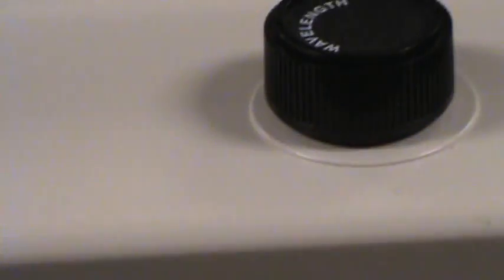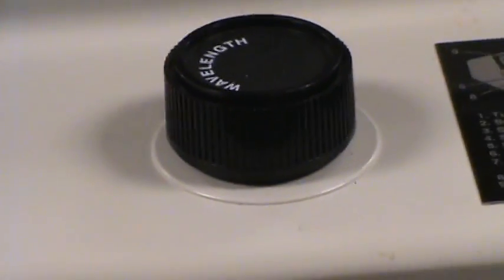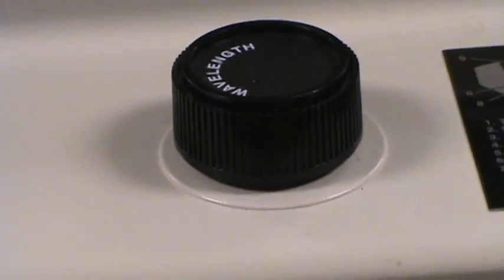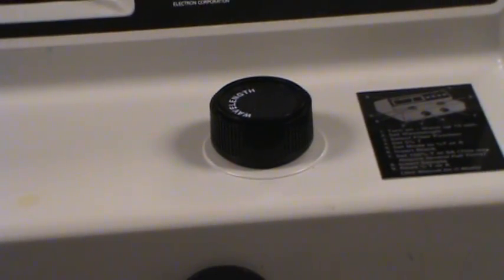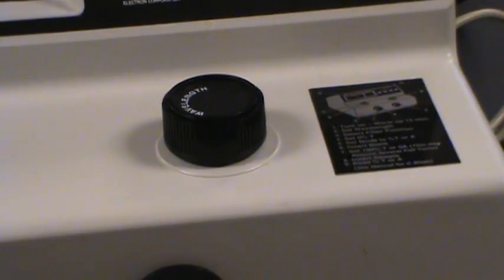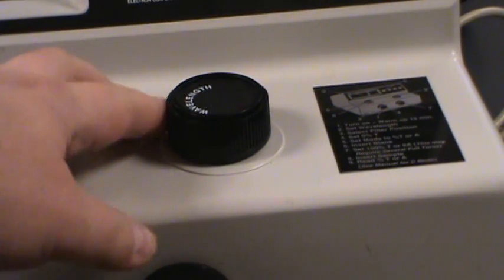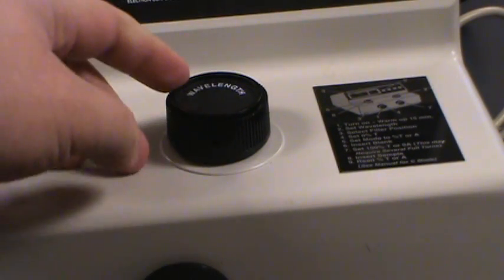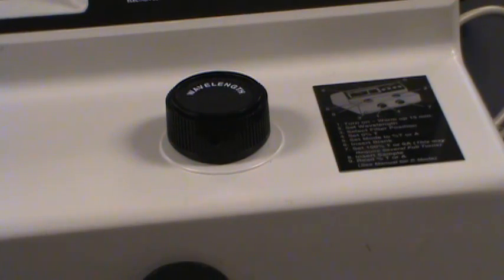Moving up to the top of the instrument we've got a wavelength selector. So this switch says wavelength. This is what we're going to use to select the wavelengths for our experiment.